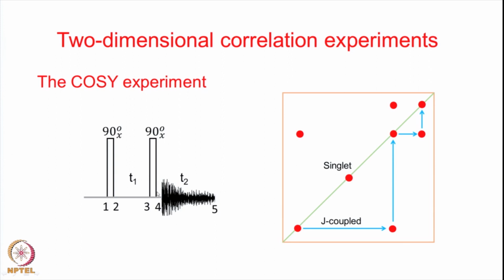It is just the minimum required to see that there are no effects of the transmitter on the receiver directly. Here the transmitter is put off and the receiver is on. There should be no direct interference between the transmitter and the receiver, only that much gap is given, which is of the order of a few microseconds sometimes. So this is not really a long time gap. We started looking at the theory of how these diagonal peaks arise, how the cross peaks arise, and what their structures are, and we did part of that in the last class.